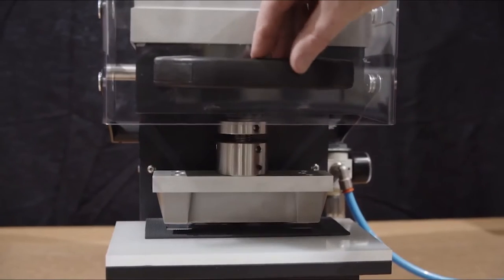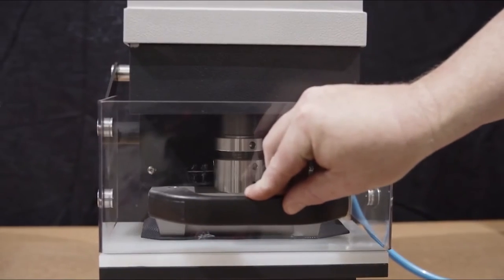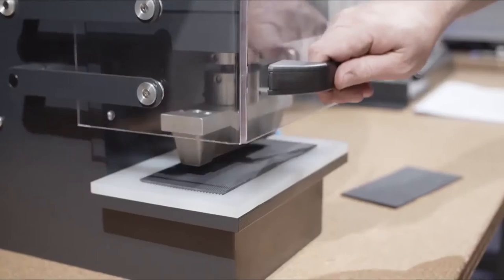Simply load the sample, pull the lever, and let the machine do the work. It's a simple and accurate tool for cutting a variety of materials.